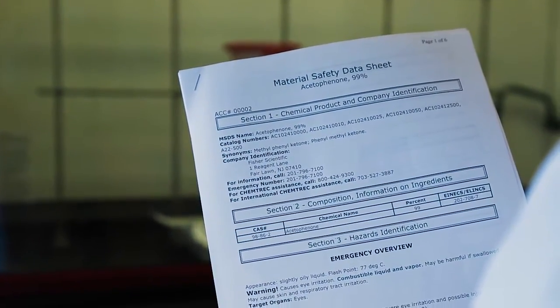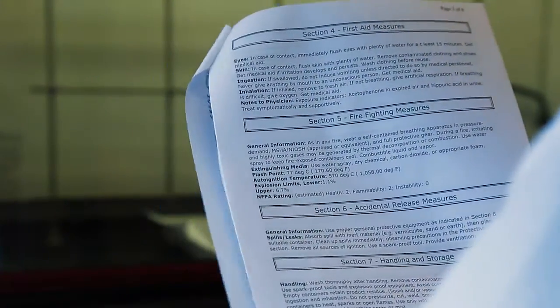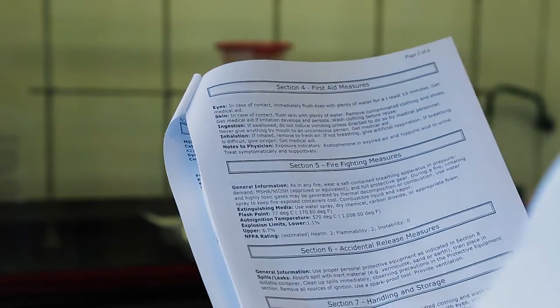Organic chemistry experiments involve chemicals that must be handled with care. As evident by the material safety data sheets, the chemicals we use can be hazardous.